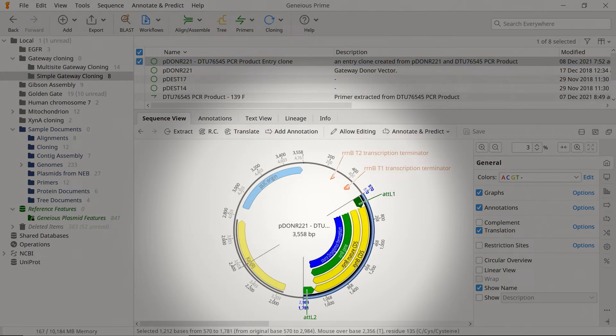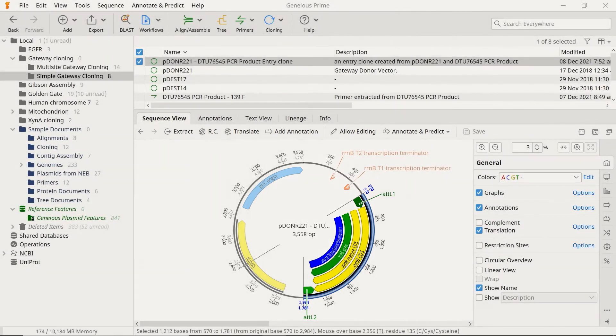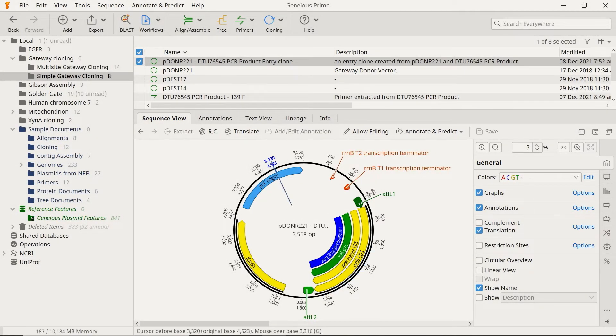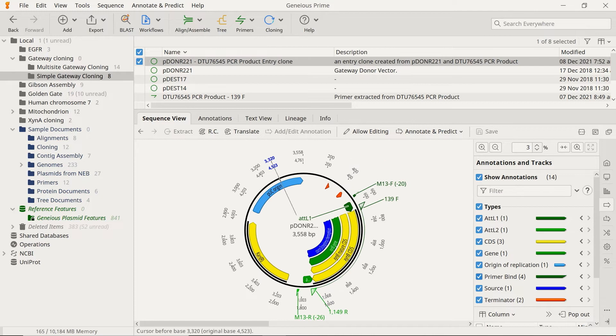These attL sites are essential for the final step, the LR reaction. After a BP reaction, it is advisable to perform a PCR on the E. coli colonies containing your Clonase-derived constructs. This step ensures you have the correct construct before proceeding to the LR reaction.